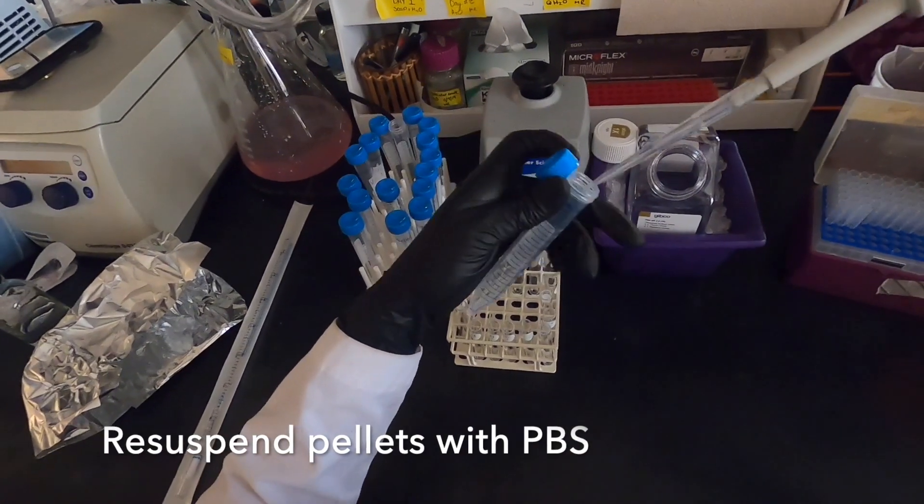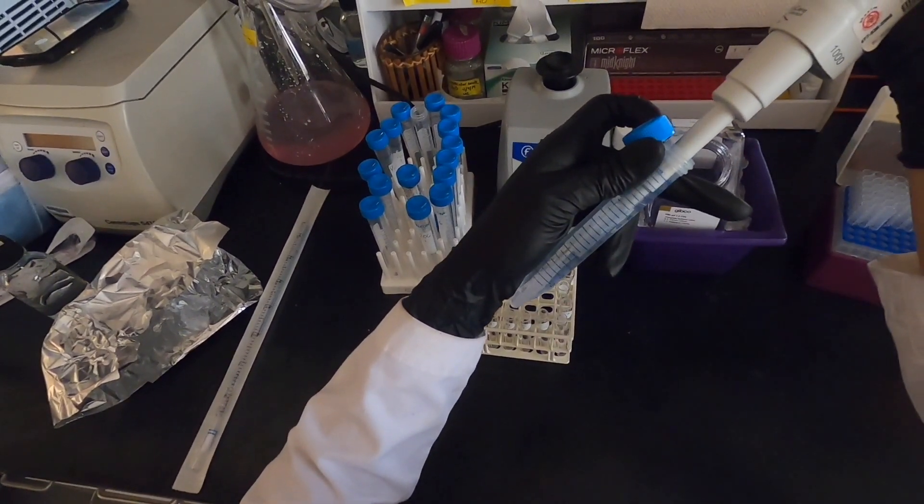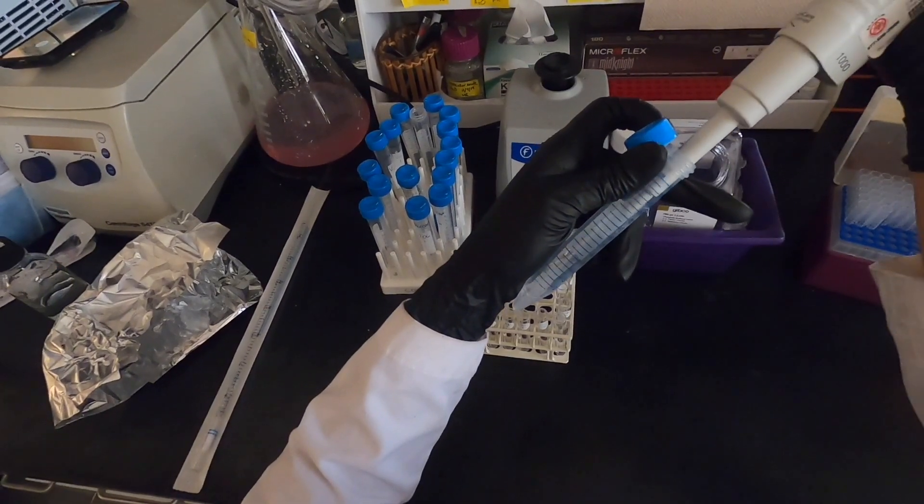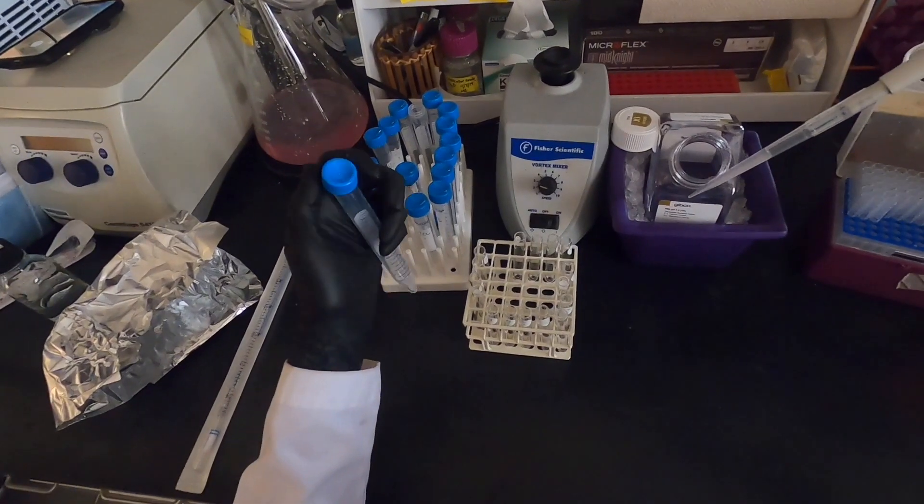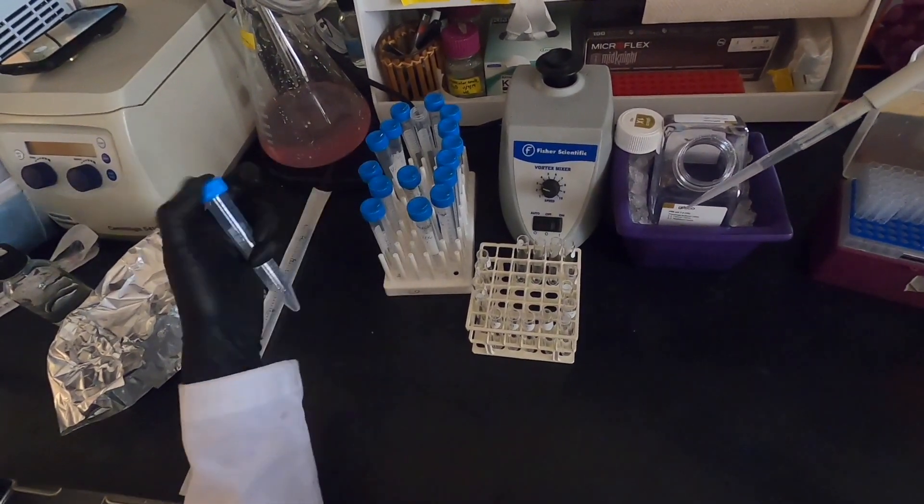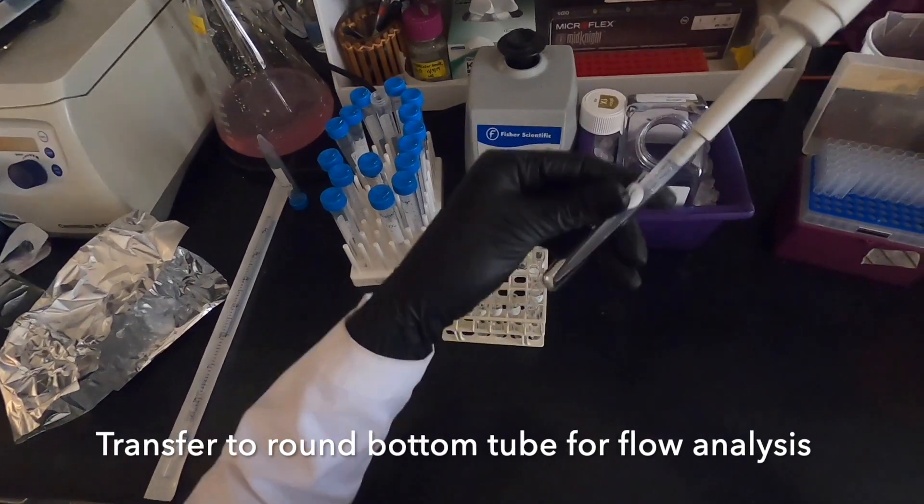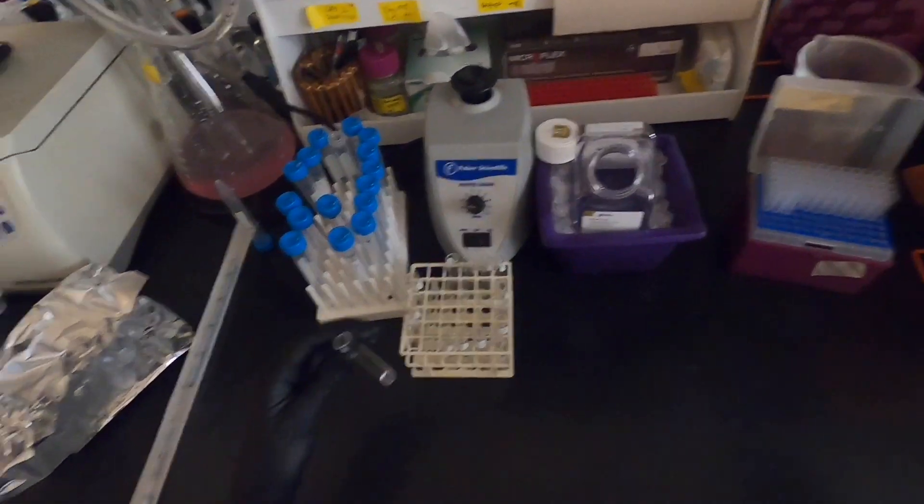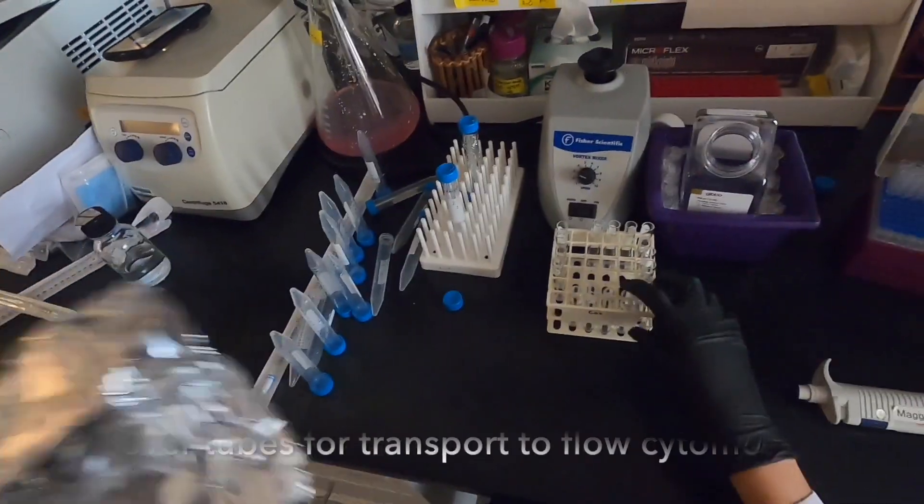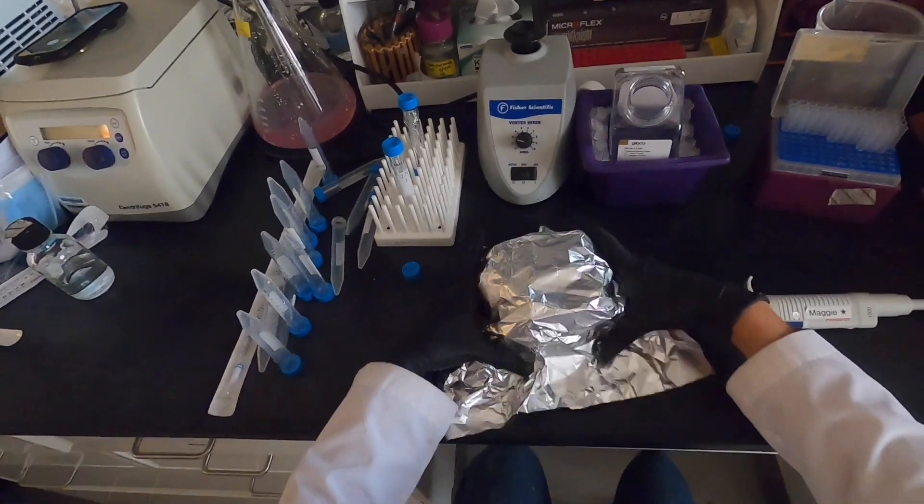Finally, we are resuspending our pellet in 500 microliters of PBS. We are also transferring our cell suspension to round bottom tubes that are suitable for our flow cytometer. We are now done with the bench work and can proceed to the cell cycle analysis using the flow cytometer.